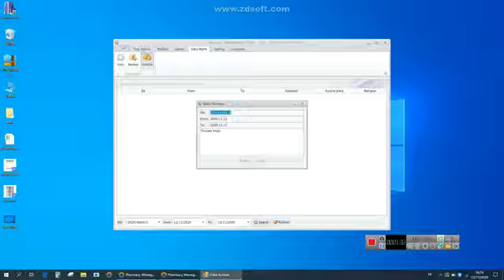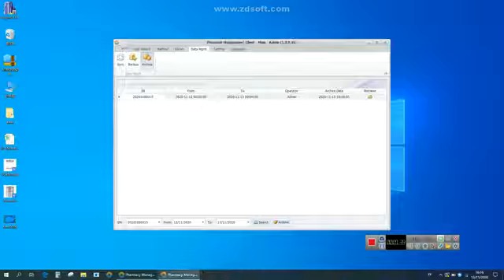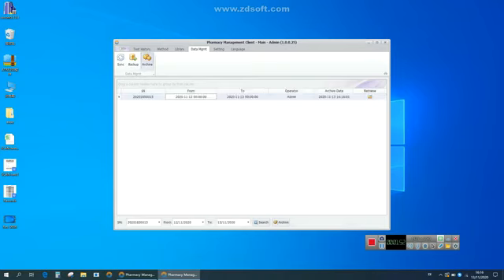Can the data be retrieved? Yes, the selected data can be retrieved. Okay, after retrieve is complete. Yeah, retrieve is complete. So we complete test 11.